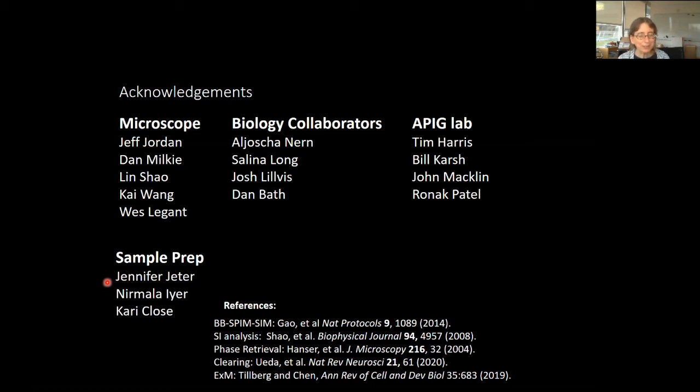If you're doing plane illumination microscopy, I feel certain that there are public domain versions of the analysis out there. Unfortunately, I don't know where they are, but I'm certain that they're out there. If any one of you really wants to do structured illumination, I will engage to do a search for you and tell you how to do it. I know it's widely used enough that it must be out there.